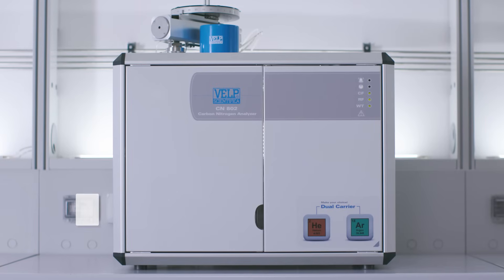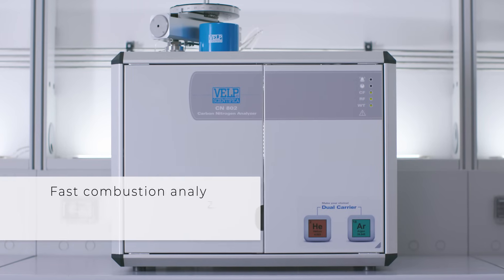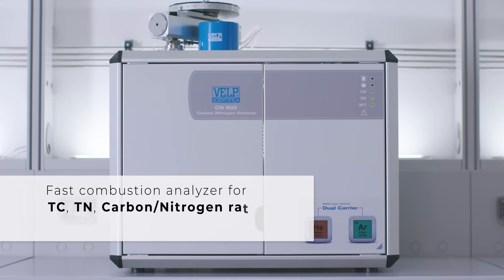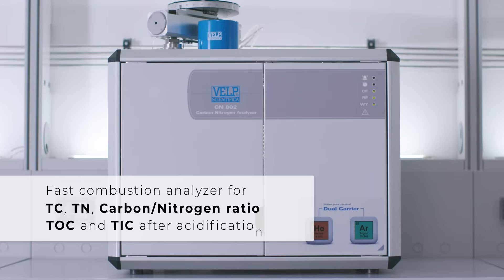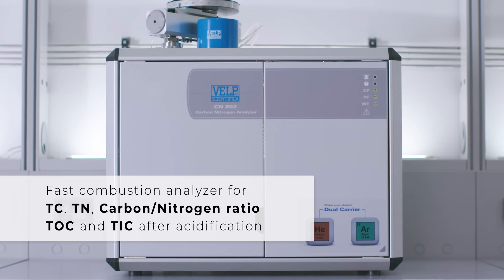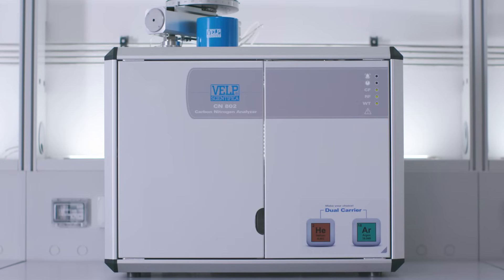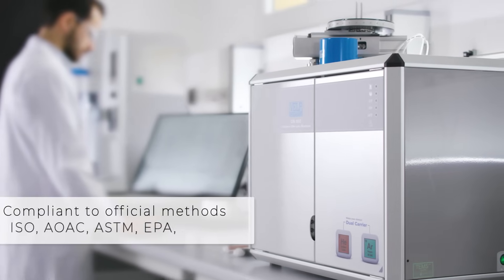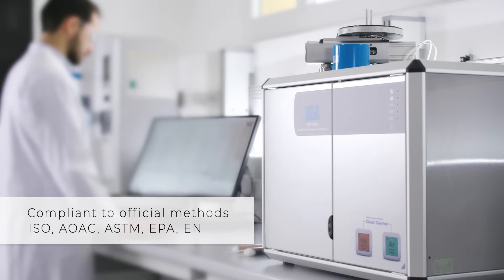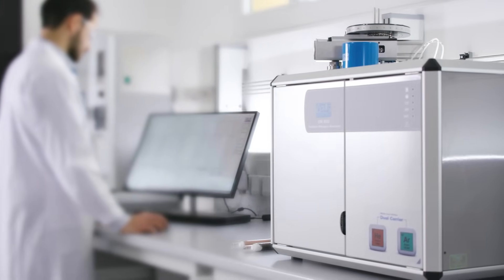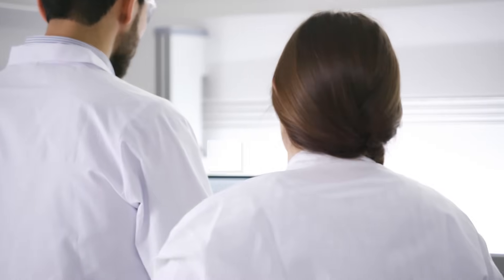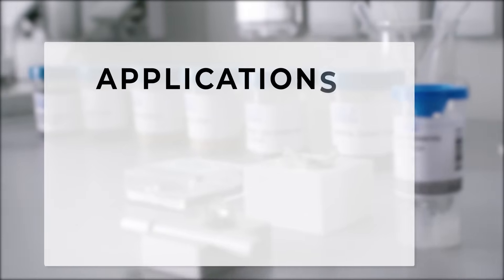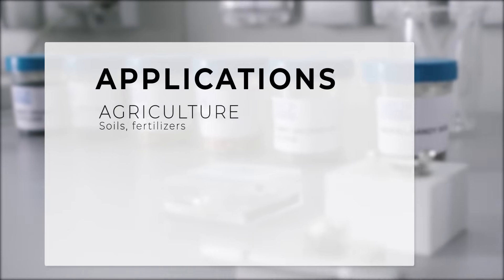The VELP Scientifica CN802 is the accurate and precise combustion analyzer for simultaneous carbon and nitrogen determination in diverse organic matrices in just a few minutes. The CN802 is a robust and flexible combustion analyzer that works in accordance with official reference methods for the determination of carbon and nitrogen in many industrial sectors such as agriculture.